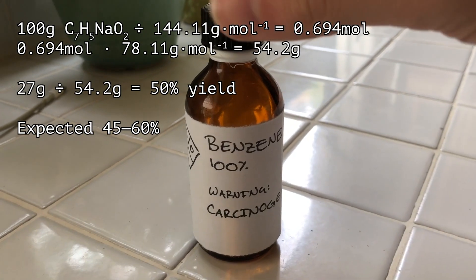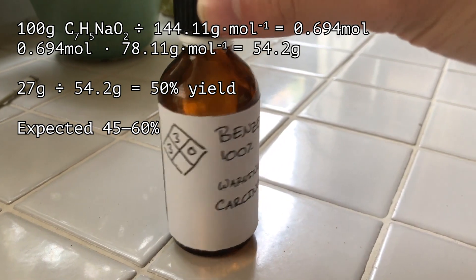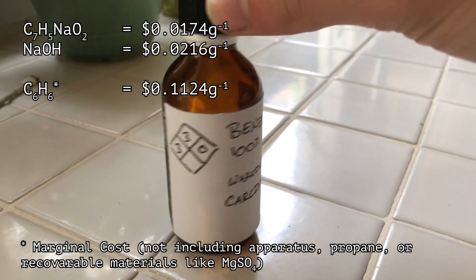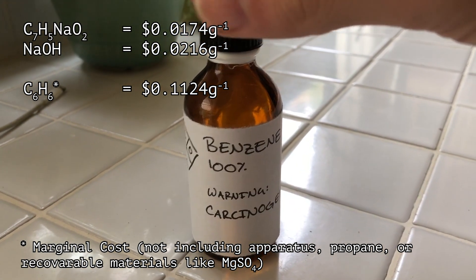The 27-gram recovery represents a yield of about 50%. This is pretty good considering the expected yield of 45 to 60% according to the Science Madness Wiki. Additionally, with the price I paid for the reagents, it's possible to calculate the marginal cost of the benzene, which is about 11 cents per gram.